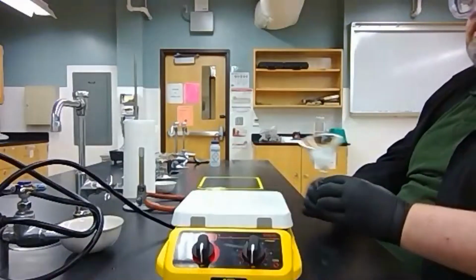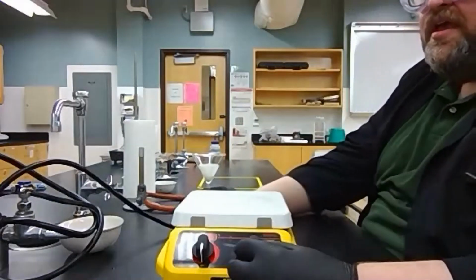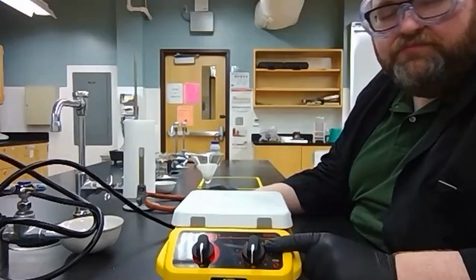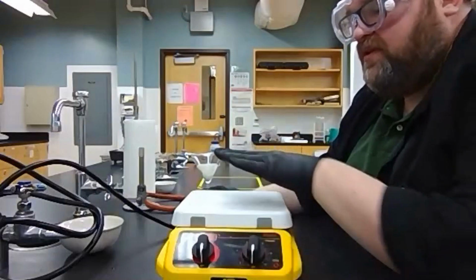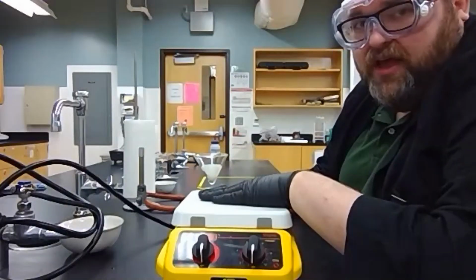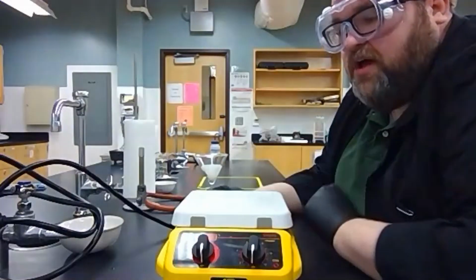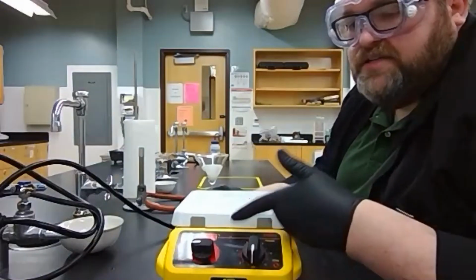So what we're going to use is called a hot plate. And this is just like a hot plate that you would buy at your house, except it gets much hotter. And it has one other feature, which is called stirring. We're not really going to deal with that, so don't worry about it. The way a hot plate works is that there's an electrical element, just like if you had an electric oven or an electric stovetop, and it heats a piece of porcelain, which is what's on top here. It has a control, and a temperature readout.